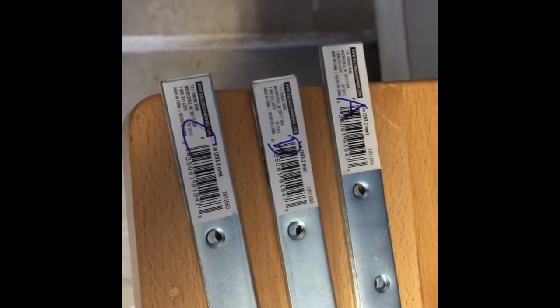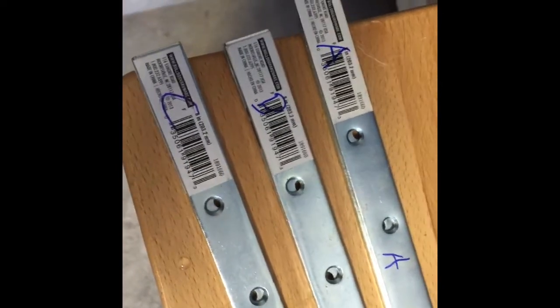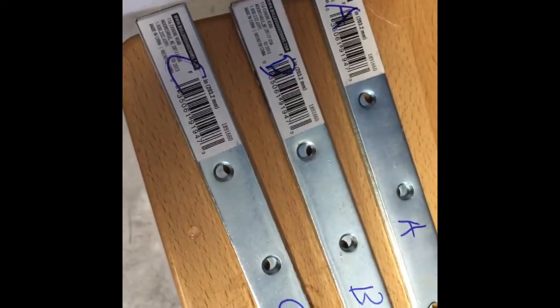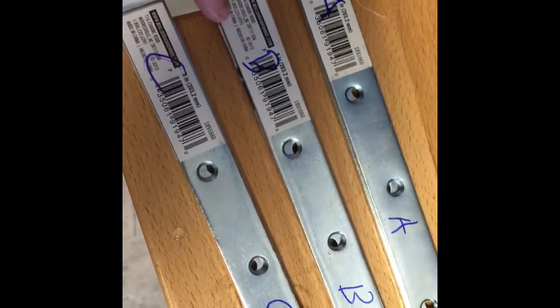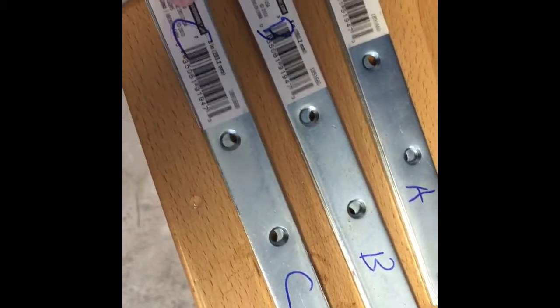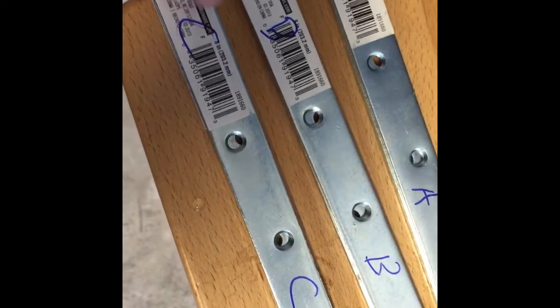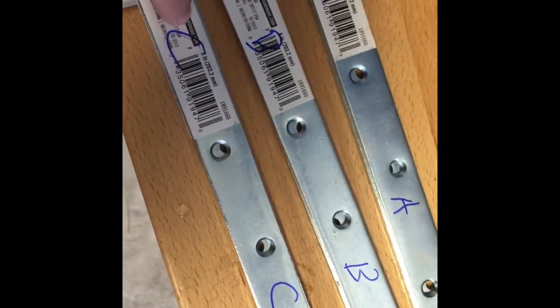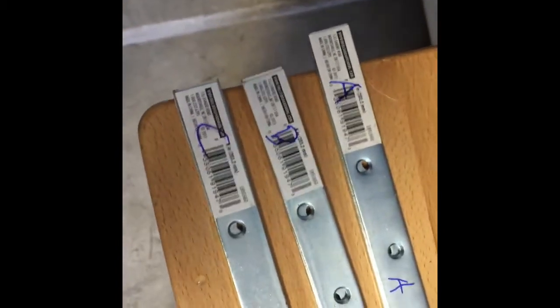We'll see if I can take them apart at all, see what the consistency looks like, see which one holds up. A was equal parts epoxy and resin. B was 3 parts resin, 1 part epoxy. Ooh, that's not good. And C, ooh, maybe B is going to be the loose one. C is going to be 3 parts of the hardener, 1 part of the resin. And we'll check again later.